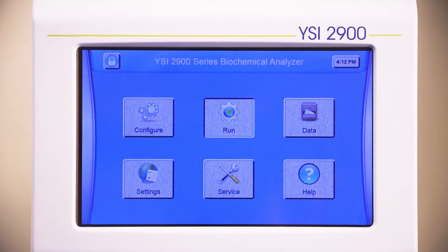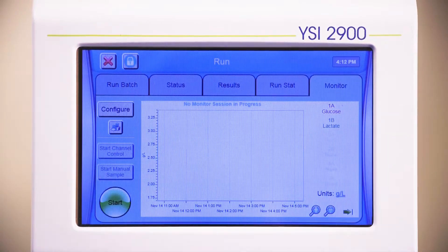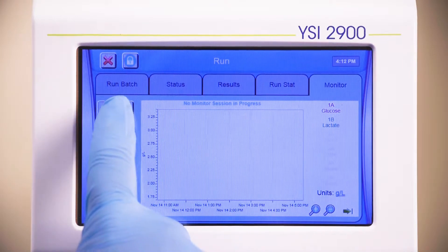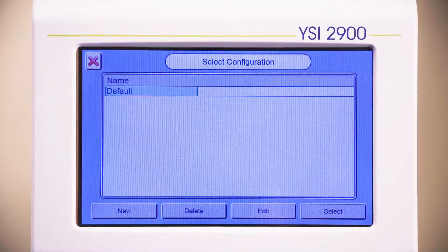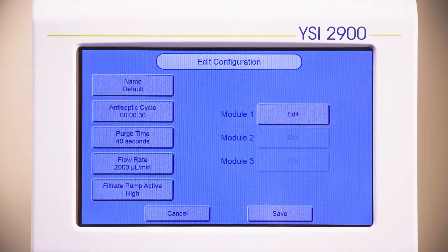On the Run screen, press the Monitor tab. To configure a monitor session, press Configure. Press New and type the name of your session.